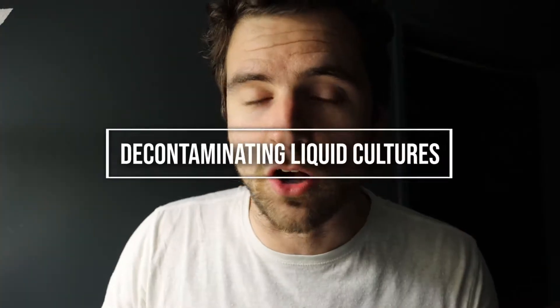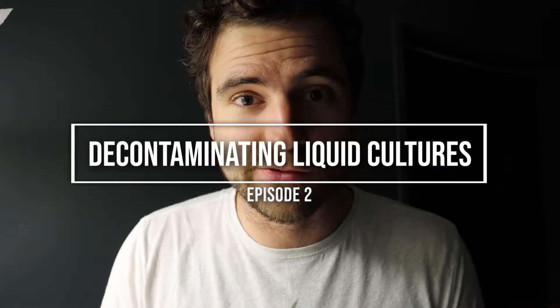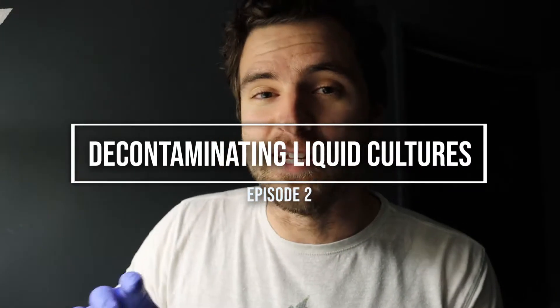Hi, this is Andrew from Of Mice and Mycelium and today is the 12th of November. I'm in front of my hood and I'm looking at our experiment for cleaning up any liquid culture that you have. I'm going to show you the next step into cleaning that up.